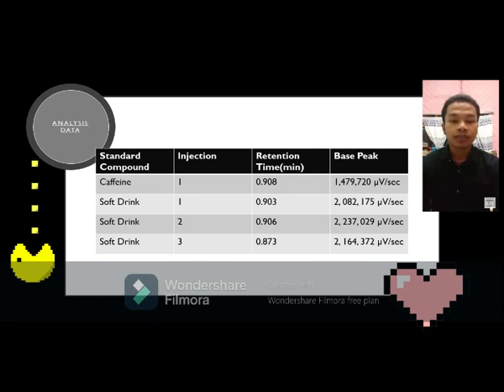During an HPLC analysis of a mixture, the compounds will separate based on their retention times. This will produce a chromatogram. An example of a chromatogram can be seen in the slides.